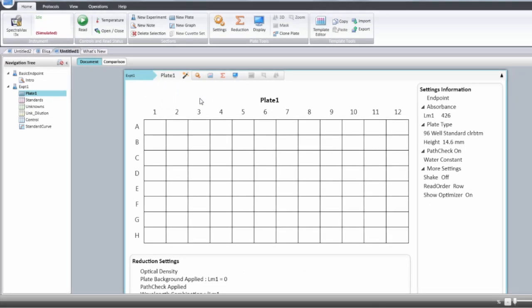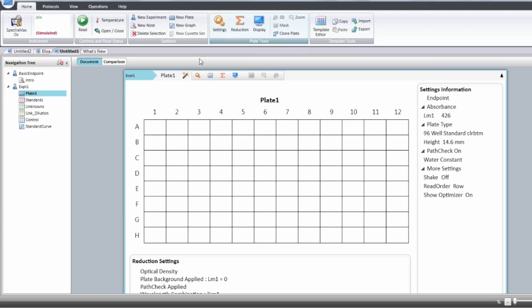In order to access instrument settings you have to go either in the top menu in Softmax Pro and select the settings or in the plate menu and select the second icon.